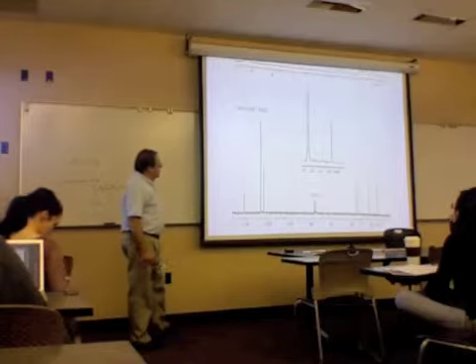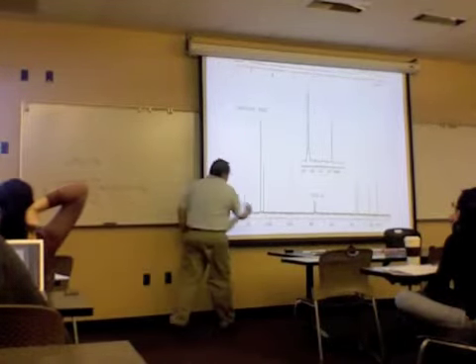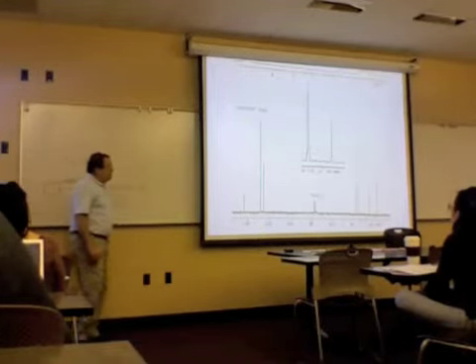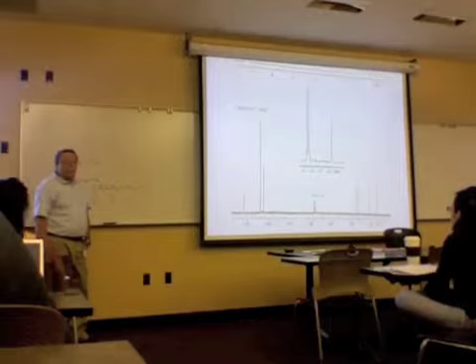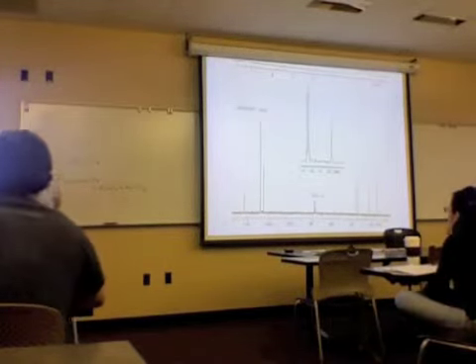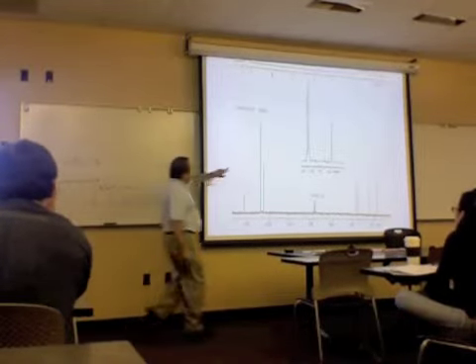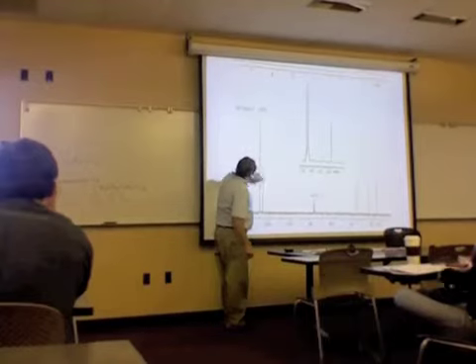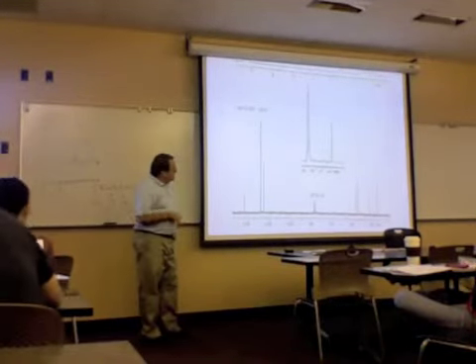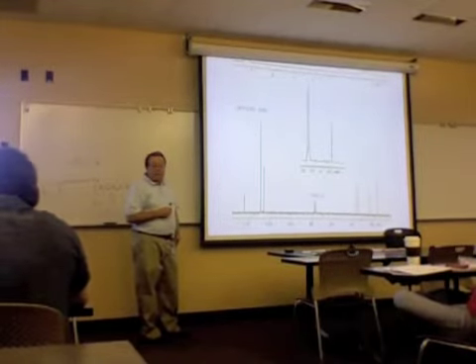Now, let's test our analytical skills a little further. Why are these 3 way down from there? They're the 4 that are part of the ring. Okay, and so there's that one, this type, and this type. So the 4 type, we have 2 buried under this peak, and then there's this and this. Those are going to be the aromatic carbons, and then the ordinary hydrocarbon chain will be down at the other end.